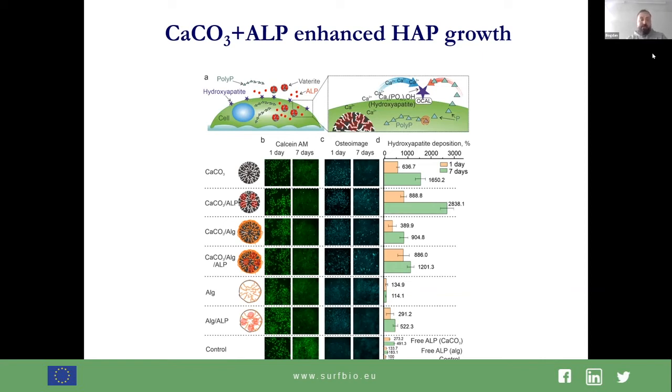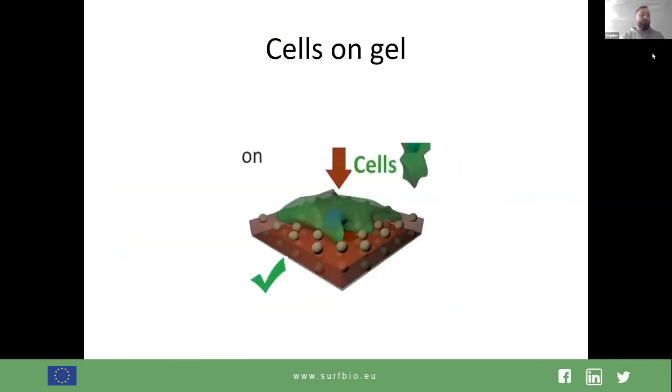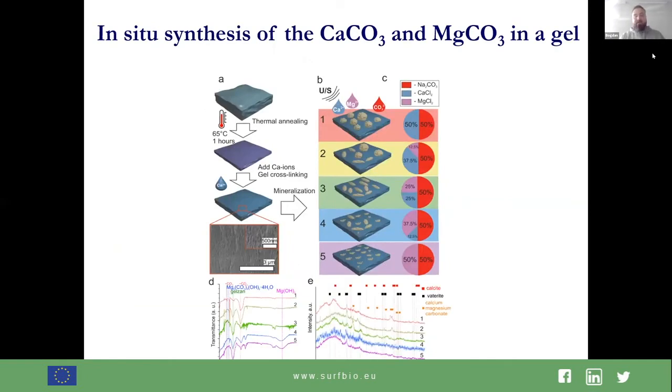It means that such particles together with the cells should provide the correct function, and we need to care not only about the structural function, but also about absorption. Because it's very difficult to work in 3D, we go to a 2D model. We try to understand how the cells grow if we just make the gels, do the mineralization, and condense the gel to enhance the mechanical properties by heating it a bit.